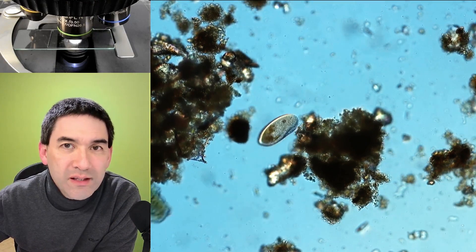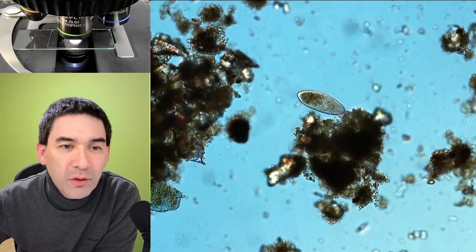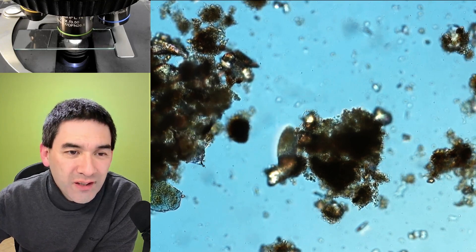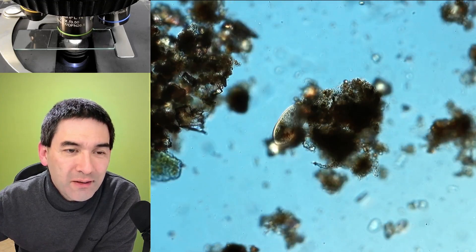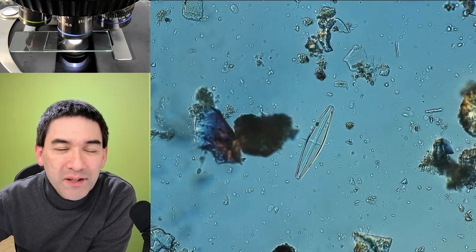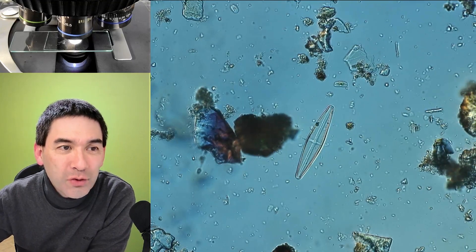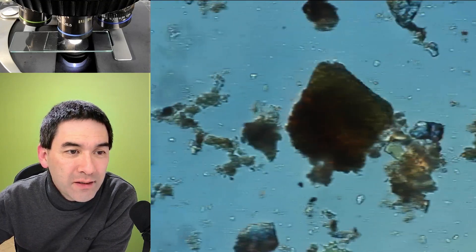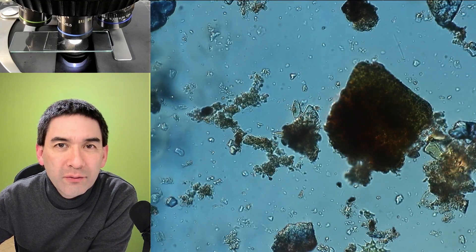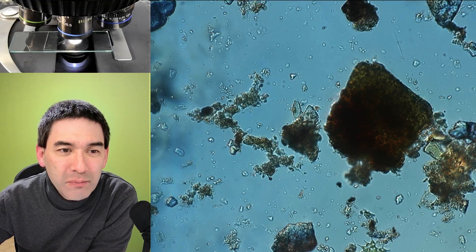Here we have again our little ciliate. You can see that it's a little bit green on the inside and that's because of the food that it eats. So if it eats a lot of green algae then of course the cell will also turn green. And of course there are diatoms, this one here is an empty one, it's a diatom shell but there are also live ones and I've already seen a few of them actually glide. Every time when there's something moving we have to take a closer look and be a little bit patient.